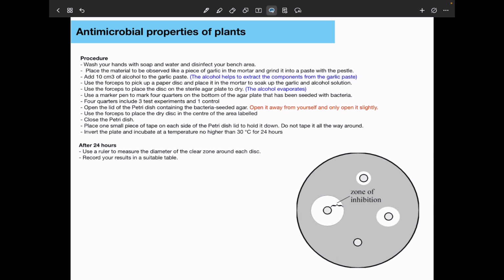So we have to make sure that we wear gloves. And again, this is to prevent maybe some allergens that will come from plant materials, as well as the microorganisms themselves infecting you or you contaminating the culture. We use aseptic conditions like flaming in order to prevent contamination or contaminating microorganisms. Make sure you do not work with pathogenic microorganisms because then you provide conditions for you to be infected.